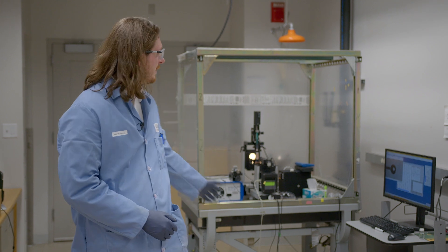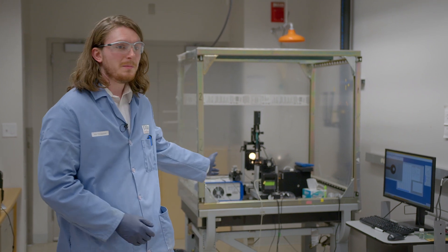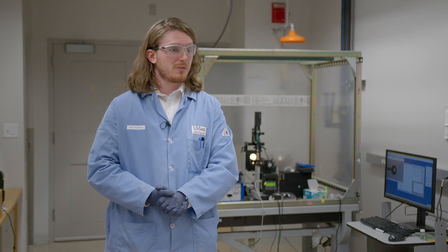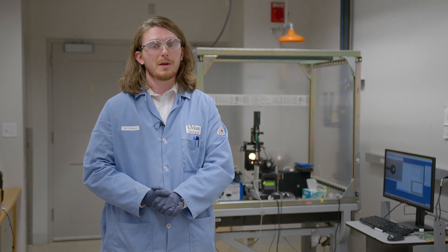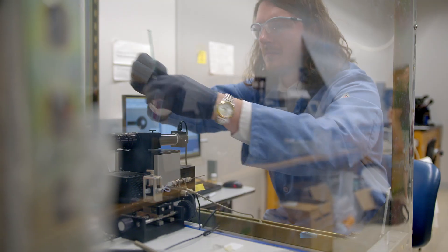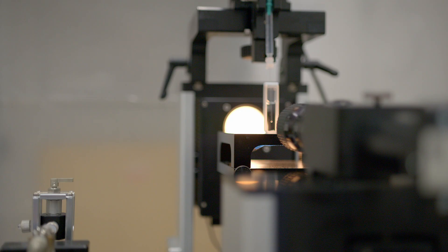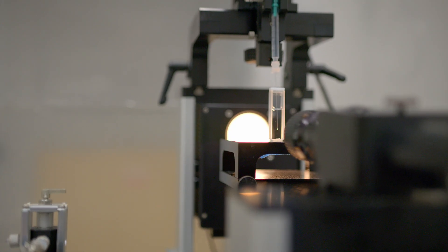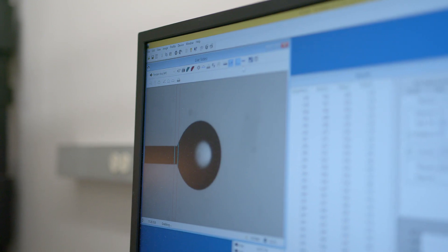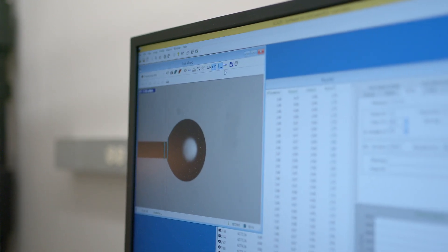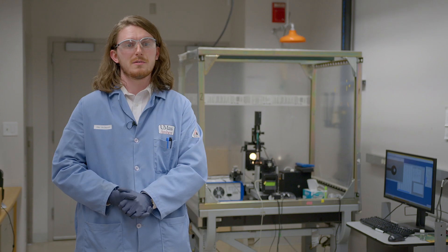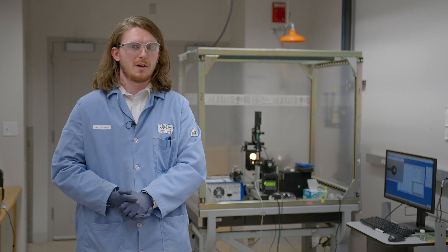This is the Russell Group's Pendant Drop Tensiometer. This is a very important instrument to our group and almost every member actually uses this as a characterization method. The way it works is that a droplet of liquid is dispersed in an immiscible fluid phase, and then a video recording is taken of the shape of that droplet, which is sent to a computer software program that calculates the droplet shape as a function of time, used to calculate the system's interfacial tension as a function of time.